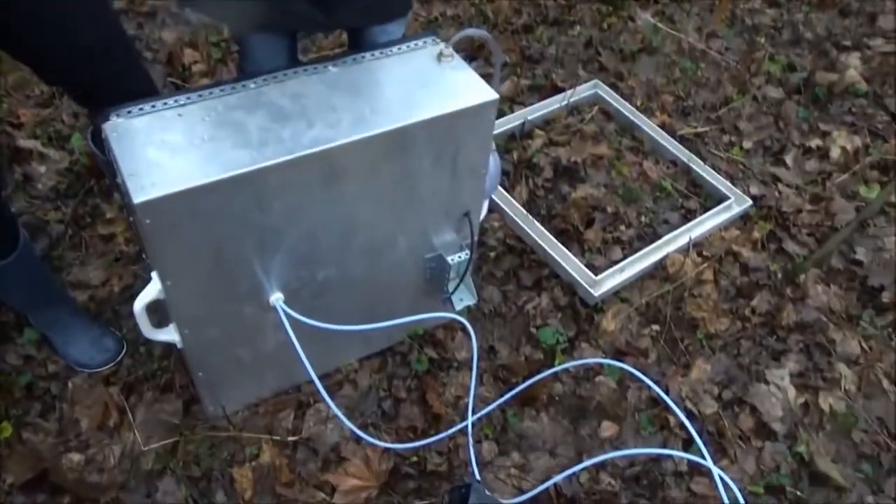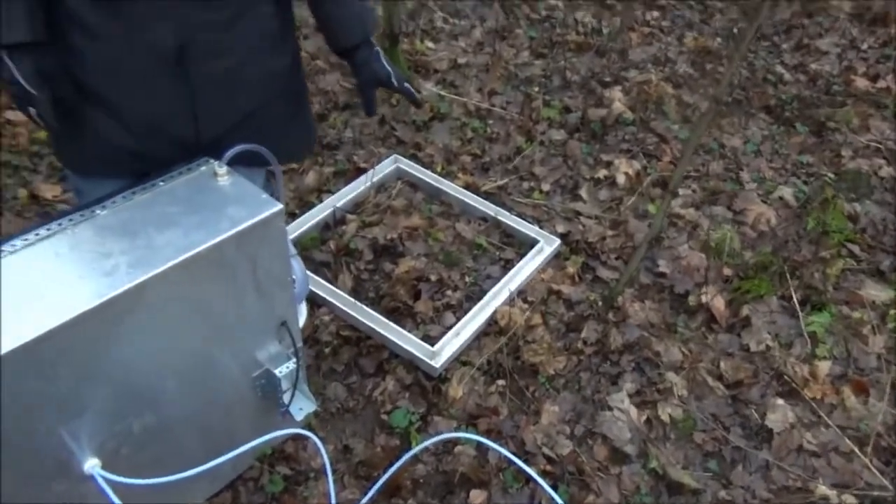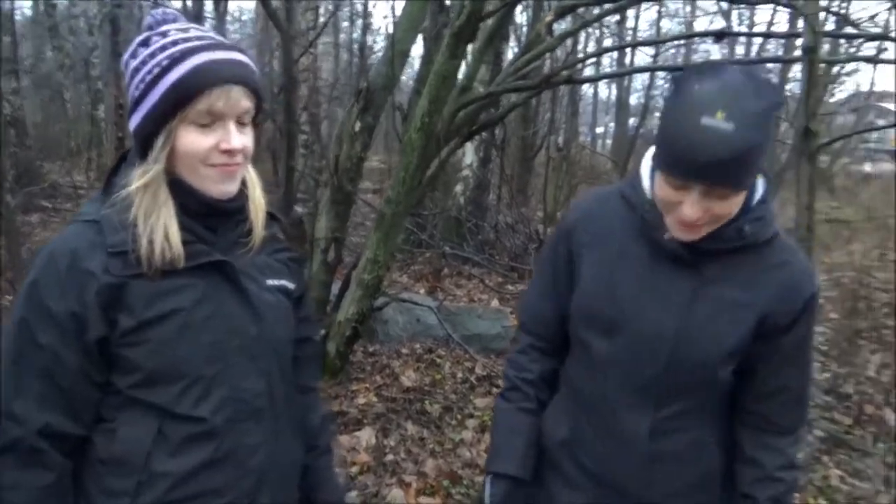Here we are starting to do some chamber measurements with the gas analyzer instrument. We have a chamber that we will put on the soil, and we expect to have CO2 and methane emissions from the soil. It's winter, so we don't know whether there's any microbial activity, but we will test. This is quite a wet place, so there might be some methane emissions. Okay, let's try.